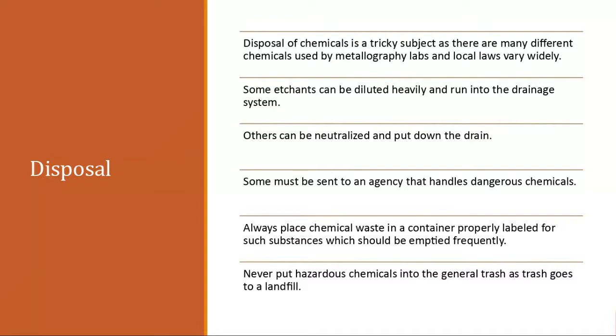Never put anything that you've exposed to acid, without neutralizing it, in the trash, because all that stuff goes to the landfill. And once again, just like if you mix the wrong things in the lab, this stuff mixes with the wrong stuff in the landfill. It can also cause issues for people that aren't even supposed to be exposed to these chemicals.